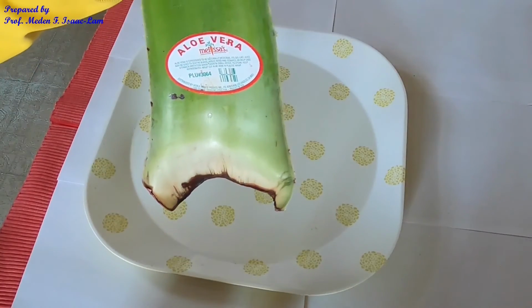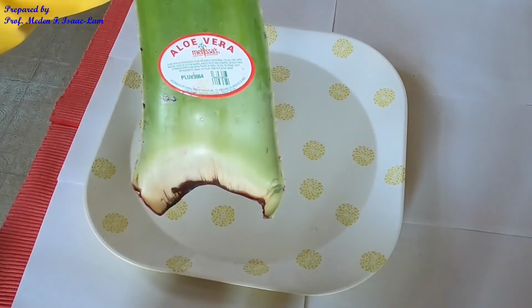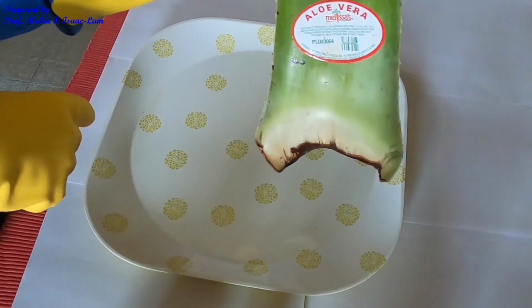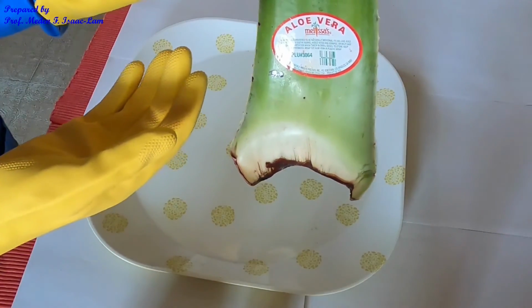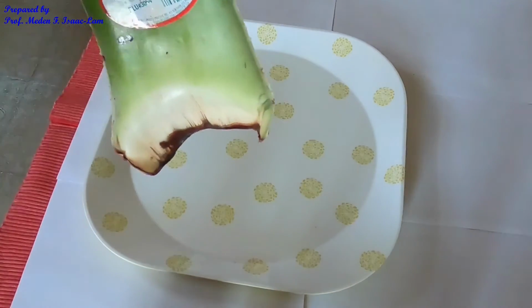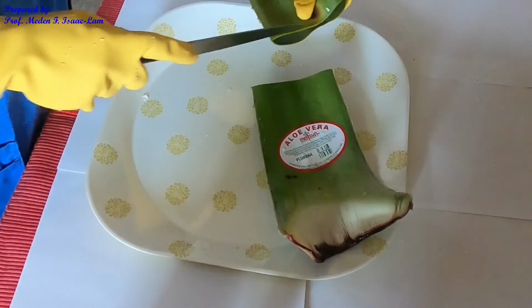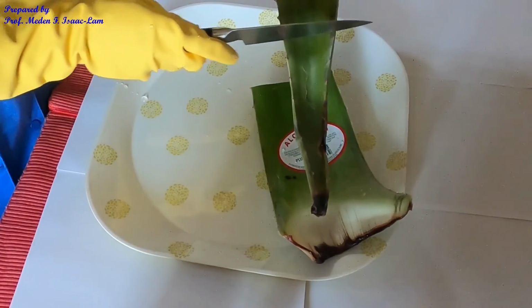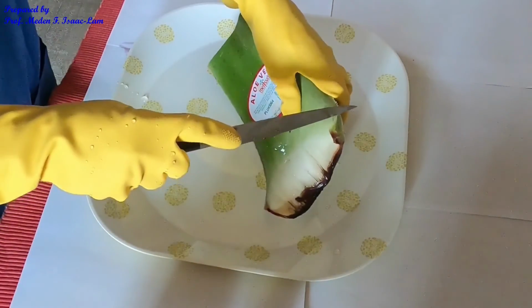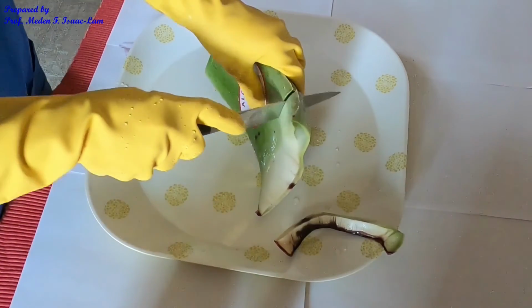This is the aloe vera plant that I'm going to show you how to cut. You can buy this in the store. It's about maybe $2. As you can see, there are spikes on this, so you have to be careful. I'm actually wearing gloves. You can wash these before you cut. You can also include this part, but you can cut this one because it really does not have anything. Now I'm going to cut this part, and then I'm going to cut like this.